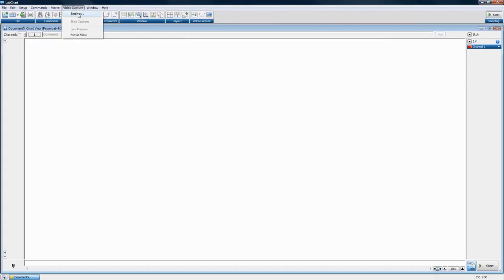That's just because we're adding new data, so we want to tie that video to the data. And if we don't have a PowerLab connected or the playback file extension, we can't really play new data or add new data to a file. So that's one of the limitations we have here, but just something to keep under your hat to let you know what you need to have connected in order for video capture to collect video.